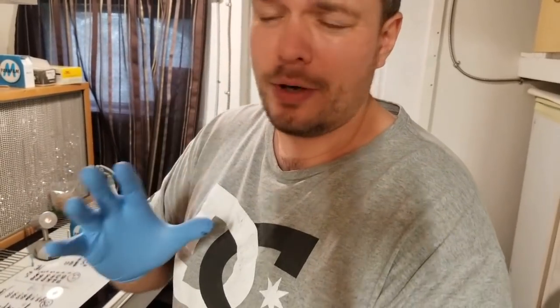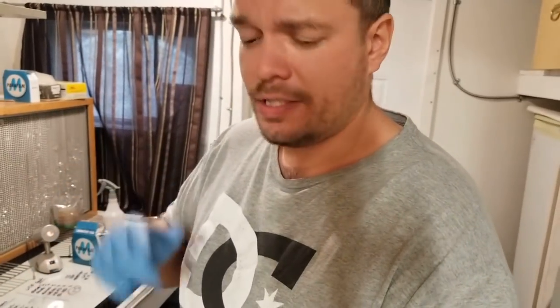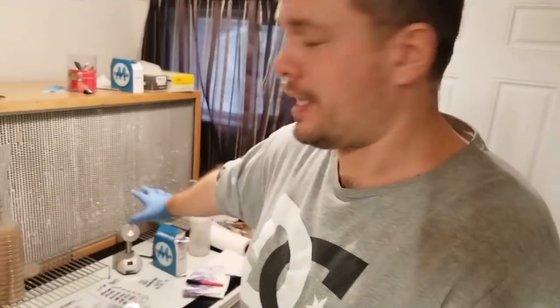We're always thinking three months in advance. So right now I'm working on our mid-April production. The stuff that I have in jars, I'm hoping will start going in the greenhouse around April 1st, and then the stuff that I'm plating right now, we're starting to expand.